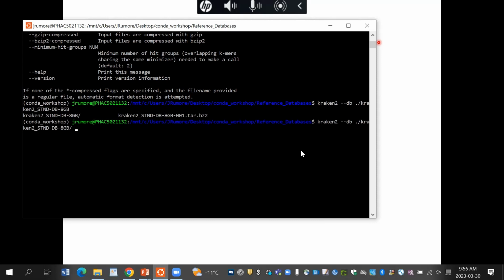The next thing we're going to do is run it with 2 threads. Typically, if you have access to high performance computing, you'll likely want to run it with more. Of course, this is going to depend on your data set. So again, I want to remind everyone that if you are using the high performance computing cluster, you are using the Slurm workload manager to submit all your jobs.